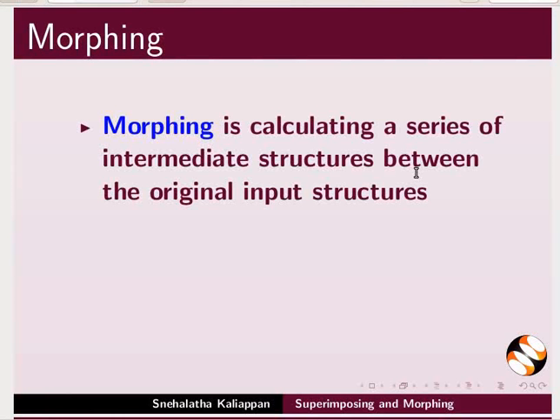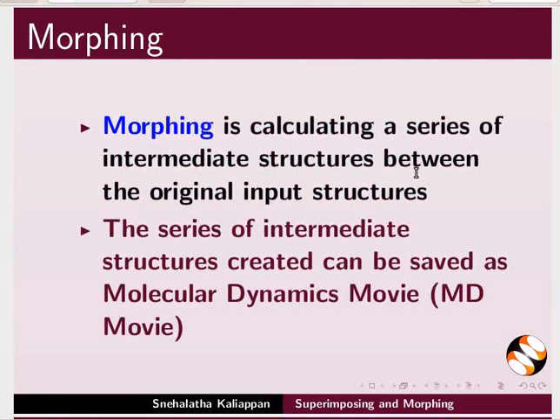Morphing involves calculating a series of intermediate structures between the original input structures. The series of intermediate structures created can be saved as molecular dynamics movie, in short, MD movie.